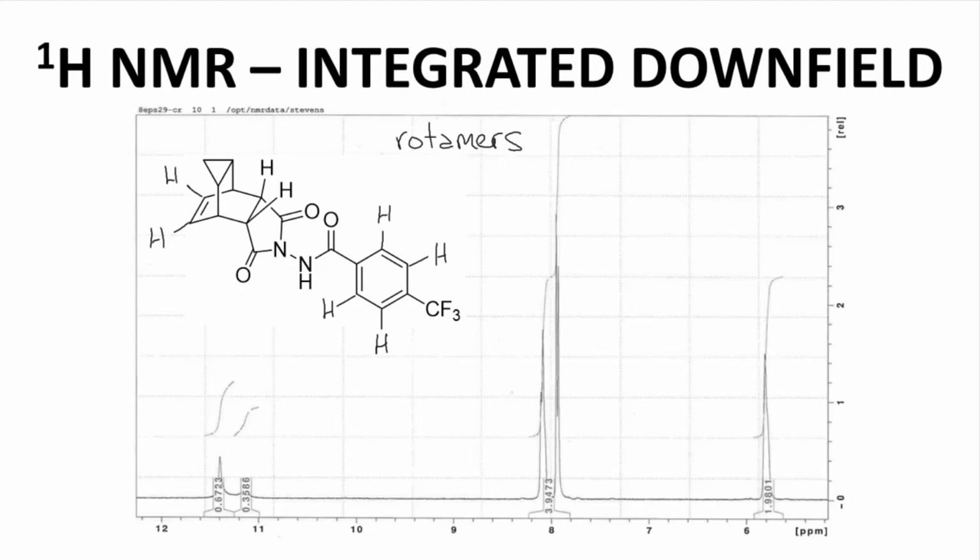First, this is a known compound in the literature, and the presence of rotational isomers by NMR in DMSO as a solvent has been reported in the literature. That's a pretty good reason. My second reason is that the 2 peaks both have an integration less than 1, and they collectively add up to about 1. So the integration for these 2 signals adds up to 1 and is consistent with the idea we are seeing 2 different signals based on 2 different conformations.